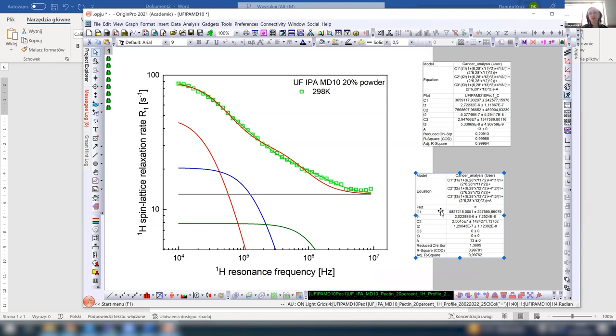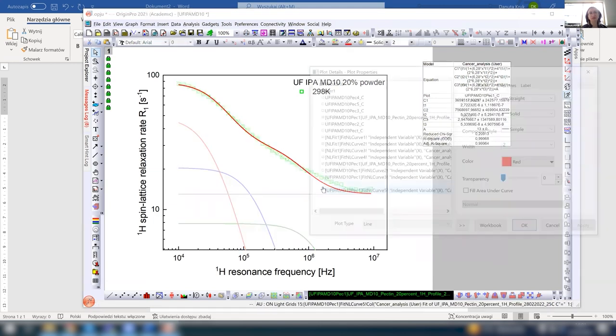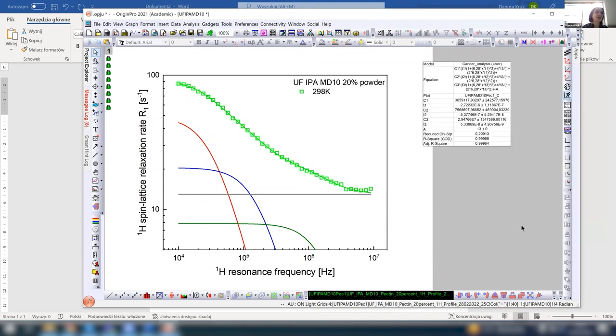Well, so you have a kind of example. Let me remove that. How one could make a kind of parameterization of the data. And this you can do always, independently of the data, not going into what the motion is about. Such a trick one can do always. In the next time, in 2 weeks, I will use exactly the same data, but to fit well-defined models, a kind of translation motion, 3-dimensional, 2-dimensional. So it will be based on reality. We'll go beyond parameterization, and then we could compare the parameters which we get from fitting some models to this model-free way of reproducing the data. But as I said, it's a way of obtaining information which always works.